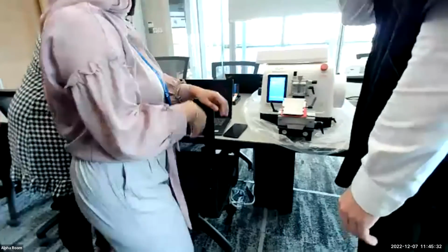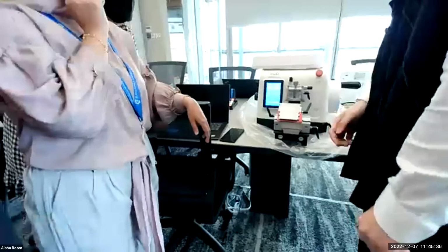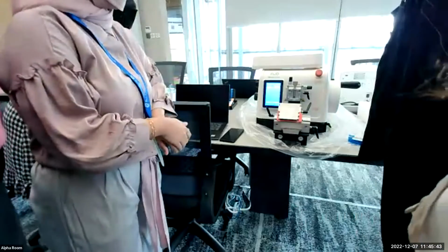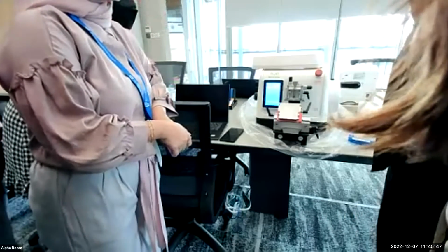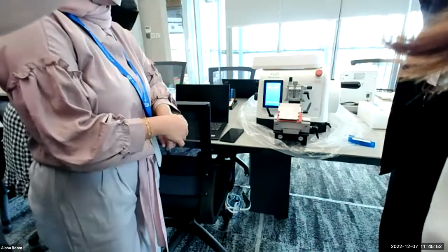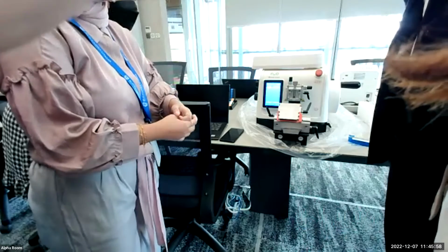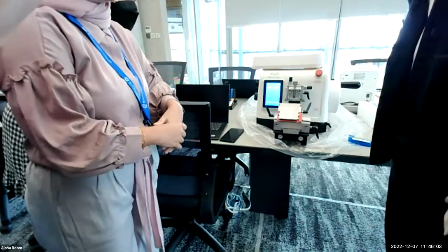Can we make a special protocol, for instance? Oh, so there is no preset program. If customers want to cut deeper tissue, for instance 5 micron, we set the preset, so they just recall the preset program without needing to set it up.